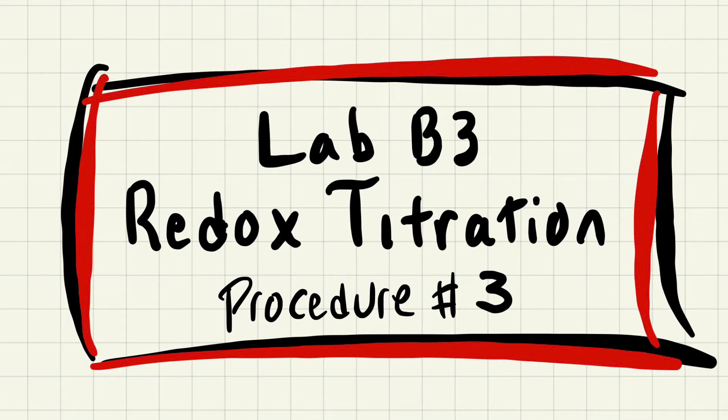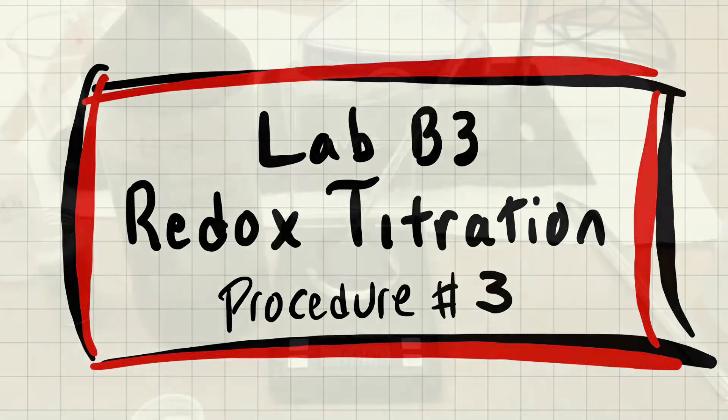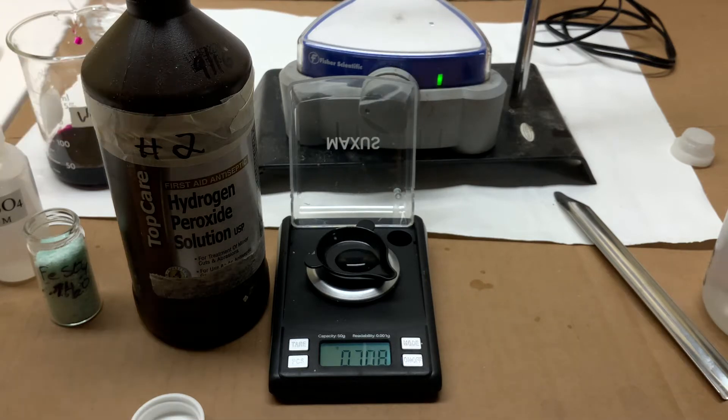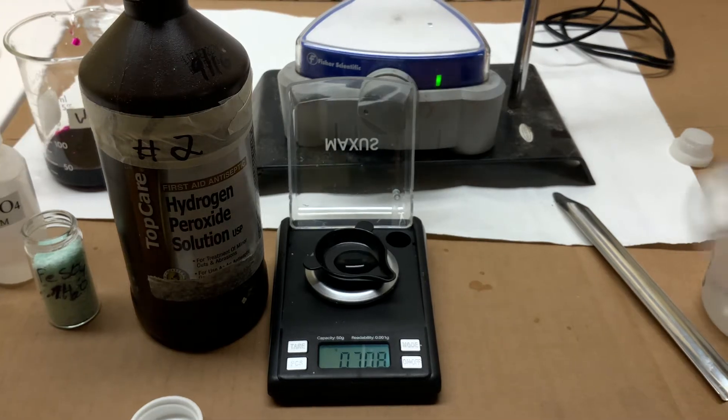Procedure 3: analysis of hydrogen peroxide. Be sure and record the mass of the hydrogen peroxide, which is 3%, or so the label says.